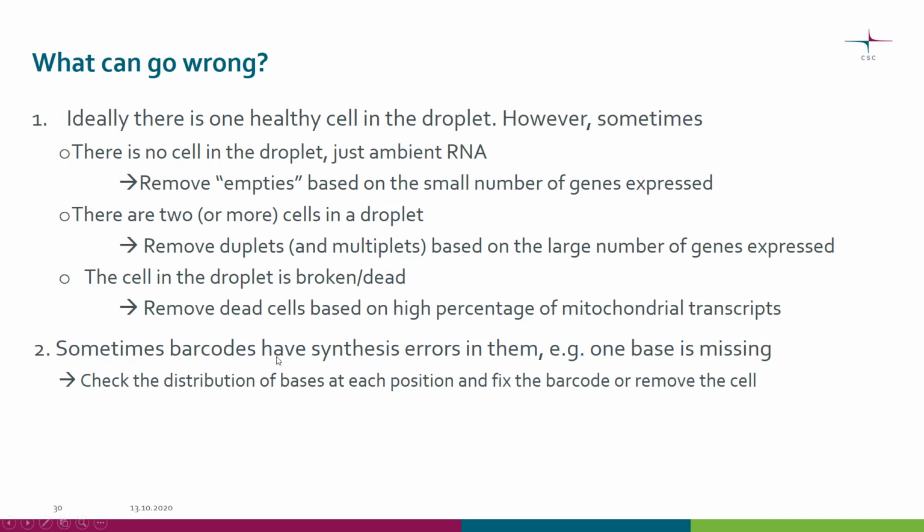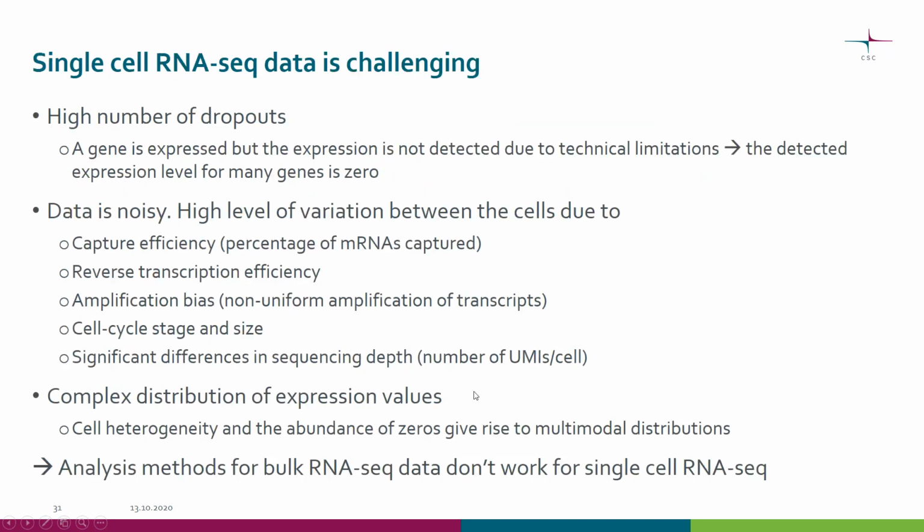In the case of Drop-seq, there can also be synthesis errors in those barcodes, but those we can detect and fix to a certain extent.